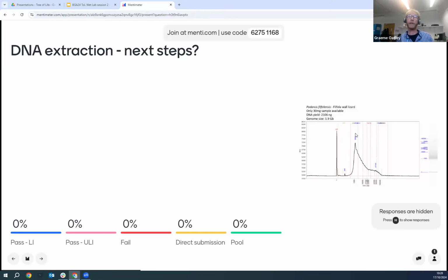When we do DNA extractions, we ideally put in 25 milligrams of material for metazoa extractions. However, we also need material to do Hi-C sequencing as well as RNA extractions. So we have to partition this sample into 3 bits to try to get data from all 3 sequencing platforms. So this is a slightly trickier one, I think.